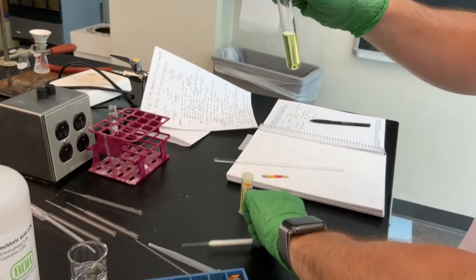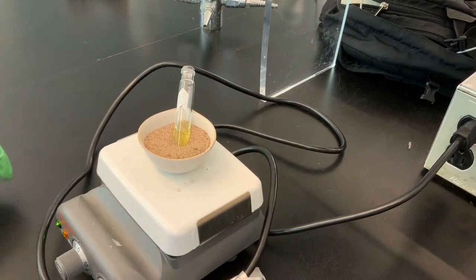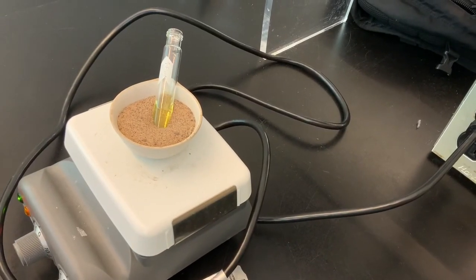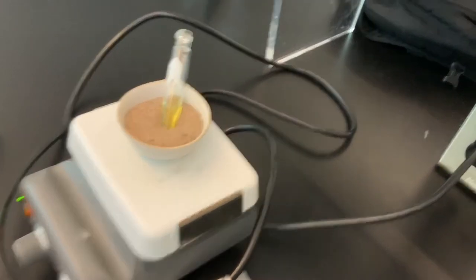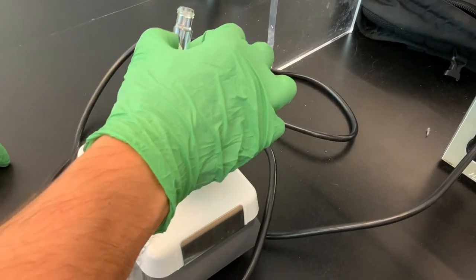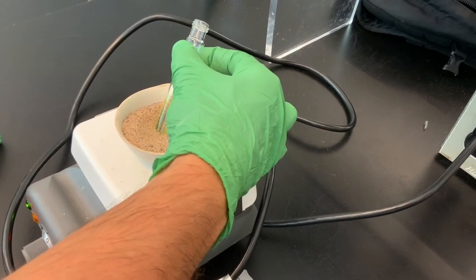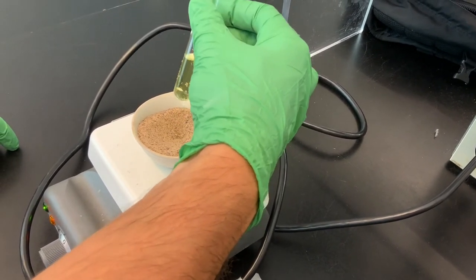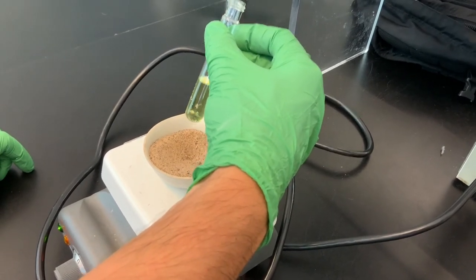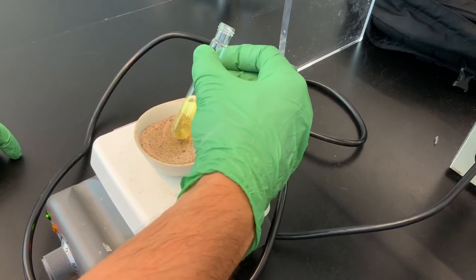And so now what we're gonna do is we are going to put it on this hot sand bath, point it away from our faces, boiling point 44 degrees, so it should come off pretty quickly. And then we'll be able to get the mass of the culture tube with the fluorenone. Oh no, it bumped. I knew that was gonna happen. So that was a source of error. It bumped a little bit and it spit out of the culture tube. So we're gonna lose some weight there. But anyway, once we've got that mass, then we'll acquire the masses of the benzoic acid and the benzocaine.